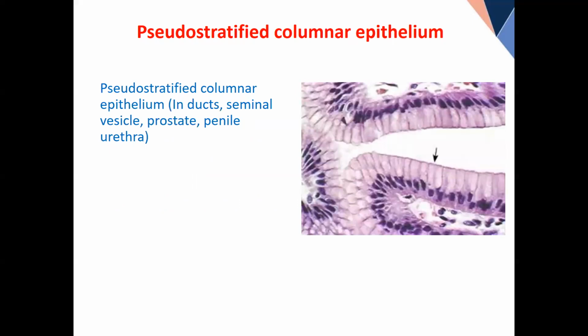Look at this. This is the first of the pseudo-stratified, where it is columnar without any association. You can see here, you have to start from here.